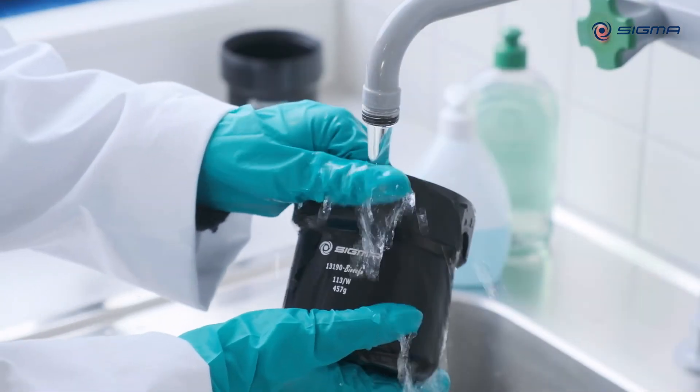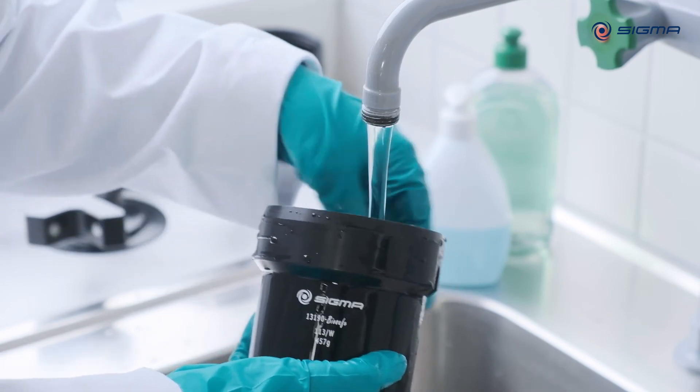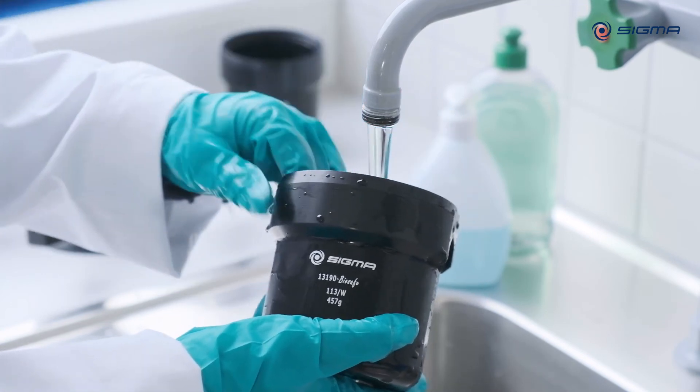If liquids that can cause corrosion are present on rotors, buckets, or accessories, clean them immediately by rinsing under running water.